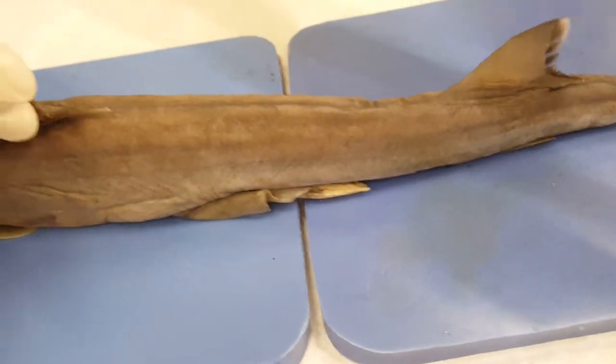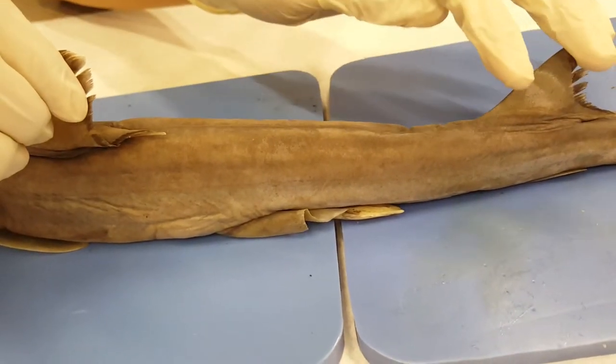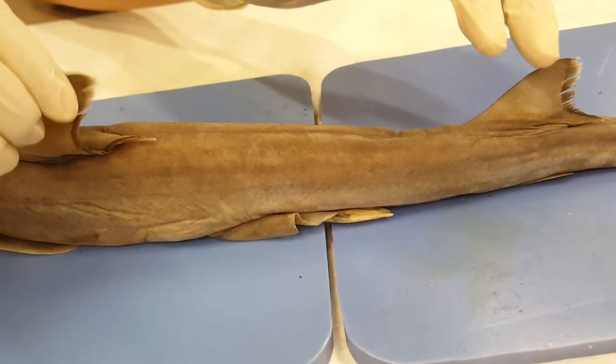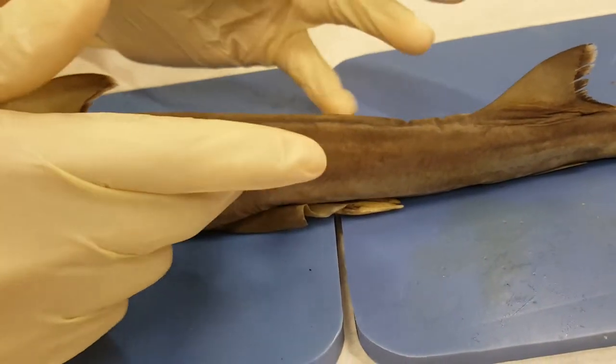Then we have the dorsal spine, which basically connects the first dorsal fin and then the second dorsal fin. That helps them with defense because it has a poison gland on it.